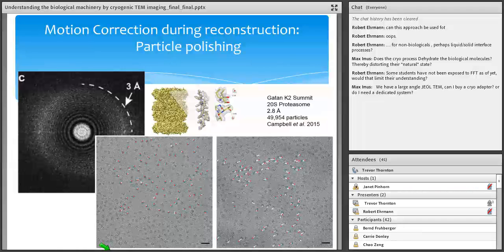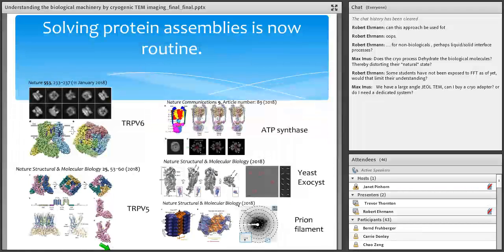Oh, I see, and that's how you acquire that final high-resolution image of what looks like a single molecule, but really it's been captured from all of these reconstructions that you're doing. And so now you understand why this is so computationally intensive. Absolutely. Yeah. But what we're doing today is incredible.